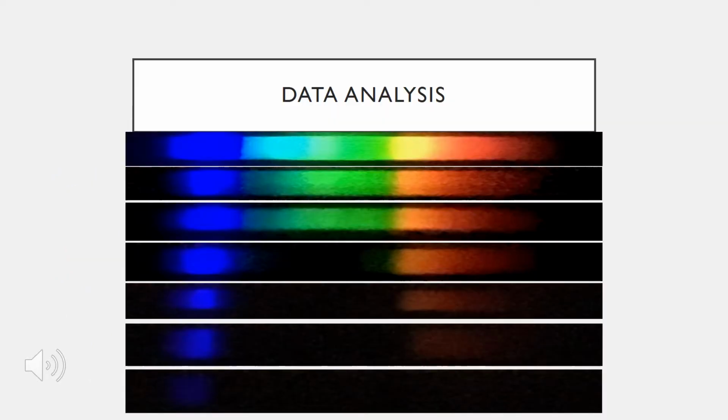The spectra shown are what we captured by passing light through the potassium permanganate solution itself first without adding the DPD. And they are shown from top to bottom in order from pure water, and then 0.0001 molar solution, then third is a 0.001 molar solution, fourth is a 0.01 molar solution, and the last 3 include the spectra we captured for the 0.1 molar stock solution. We took these multiple times in order to allow the light to properly pass through because this was the darkest sample.